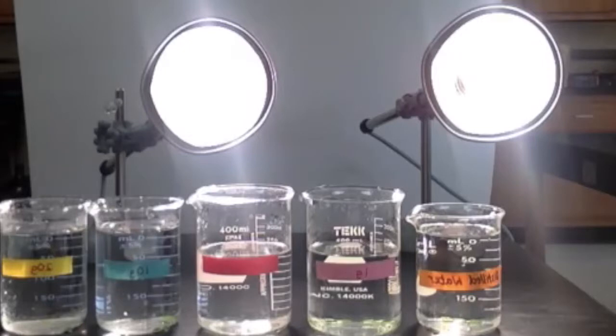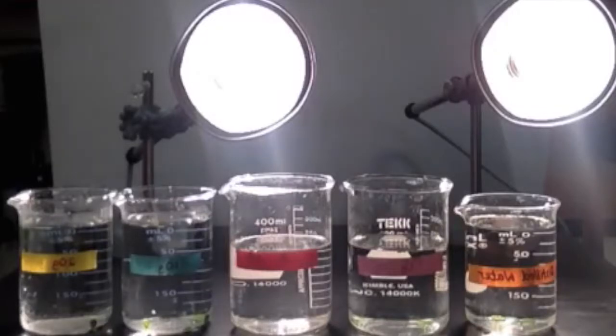There is no change until the 18-minute mark, when the 1 gram group and the 10 gram group each add 1 more floating disc. At the 20-minute mark, the final count reads 0 for the control group, 8 for the 1 gram, 4 for the 5 gram, 5 for the 10 gram, and 4 for the 20 gram. You will soon see in the 10 gram beaker that a green leaf circle will start to rise. That is because it is conducting photosynthesis and producing oxygen, thus making it buoyant and allowing it to float.